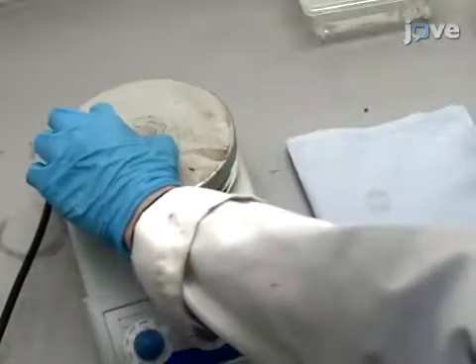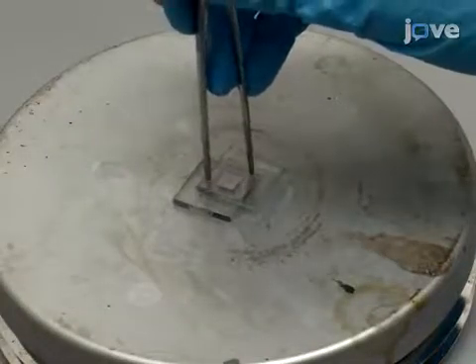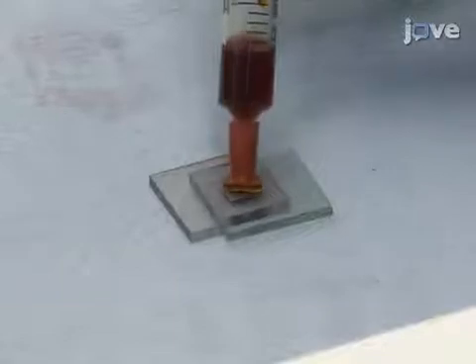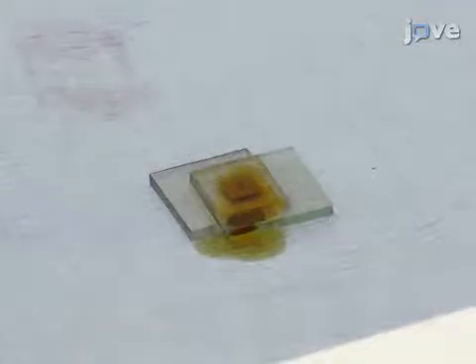Heat the cell on a hot plate at 110 degrees Celsius and apply light pressure with tweezers over the area of the sealing spacer for 30 seconds to seal the electrodes together. Complete manufacture of the cell by injecting 50 millimolar iodide tri-iodide electrolyte in acetonitrile into the pre-drilled hole to fill the gap between the two electrodes.